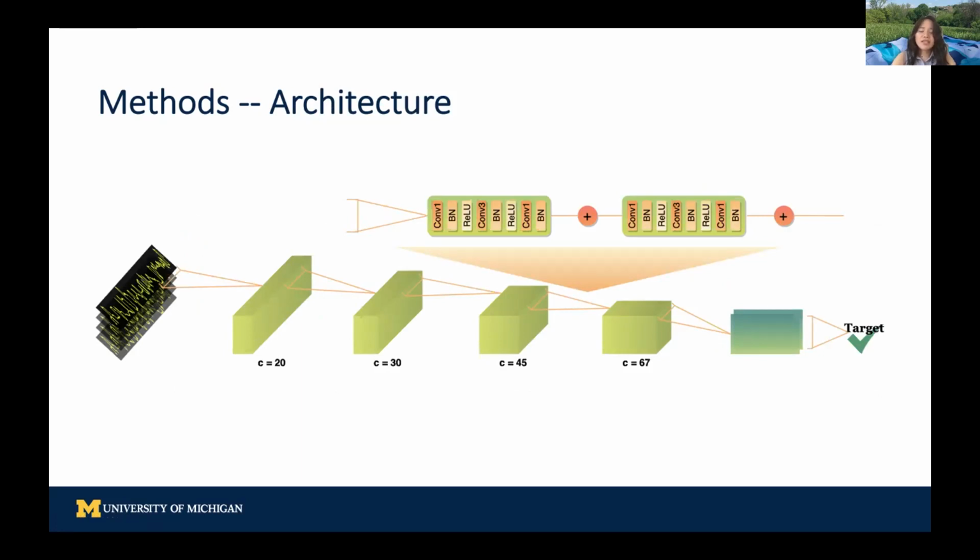We also experimented with several other approaches, including RNN, LSTM, GRU, combinations of several of them, different hyperparameters, hierarchical models, etc. However, we found that the approach based on convolution outperformed all of the other methods we experimented with, suggesting that local features are sufficient for this problem.